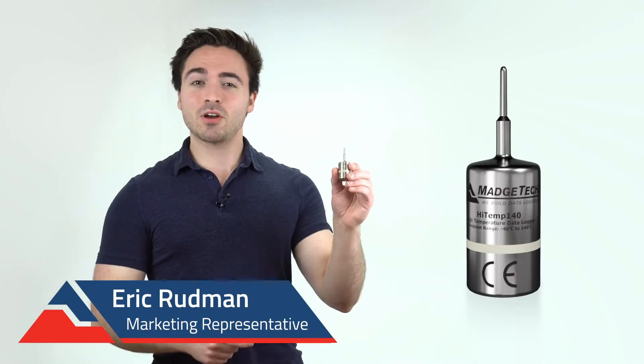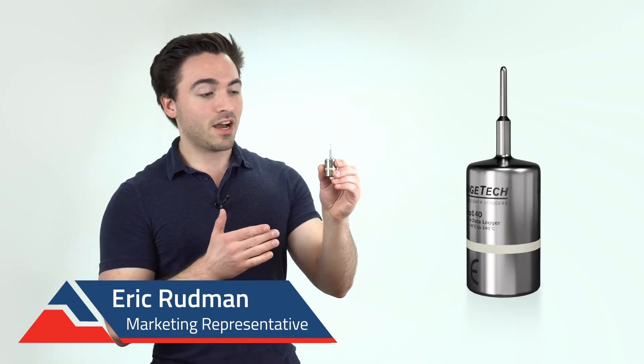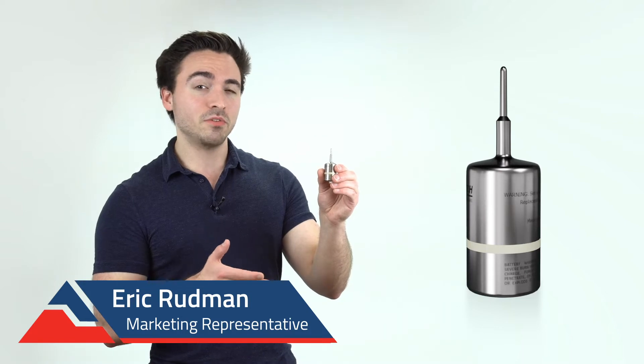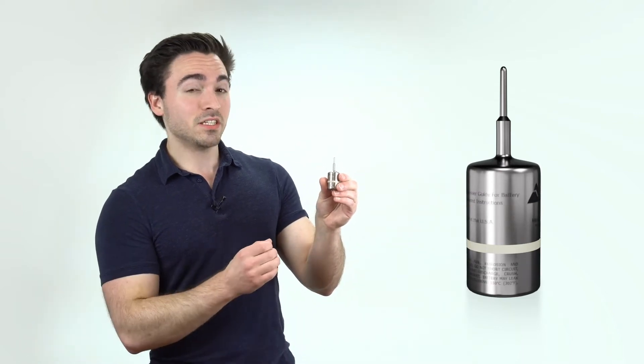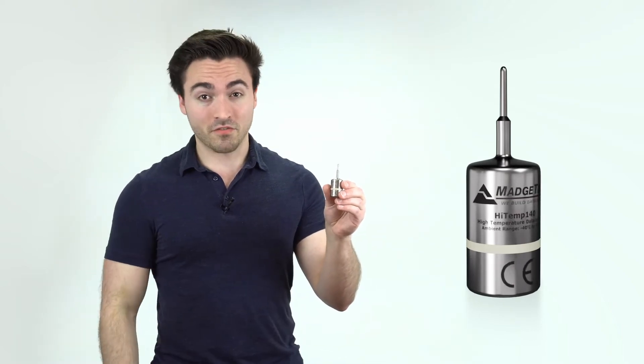Hey everyone, my name is Eric and today we're talking about the HITEMP 140. The HITEMP 140 is a fully submersible food-grade stainless steel data monitoring device and it's specifically designed to handle high temperatures in the harshest of environments.